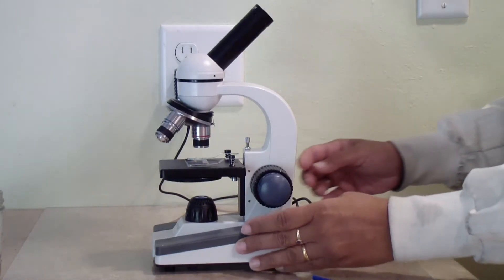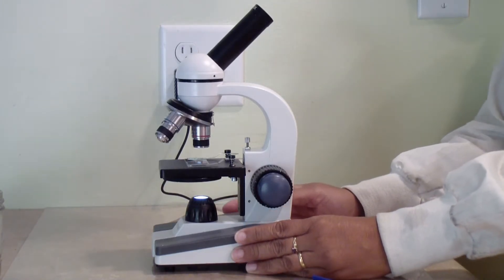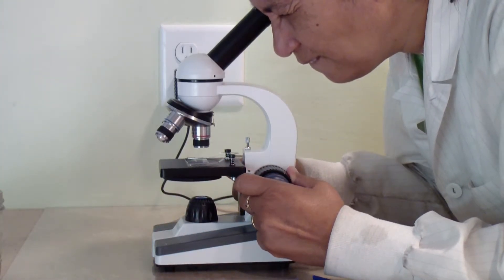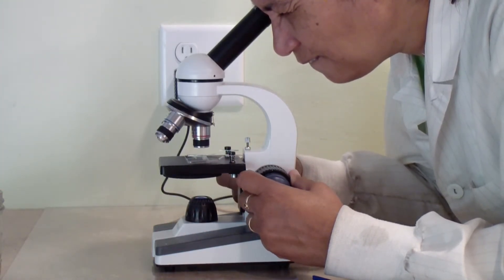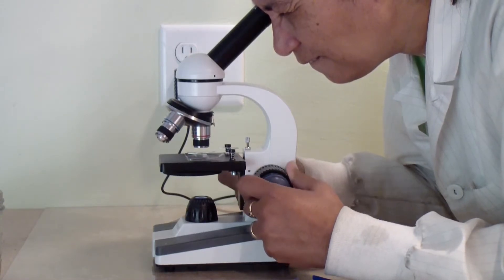Start with the low magnification and the stage all the way down. While looking into the eyepiece, turn the coarse focus knob so that the stage moves up until you can see the cotton fibers clearly.